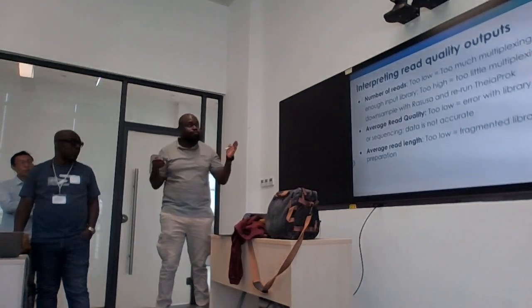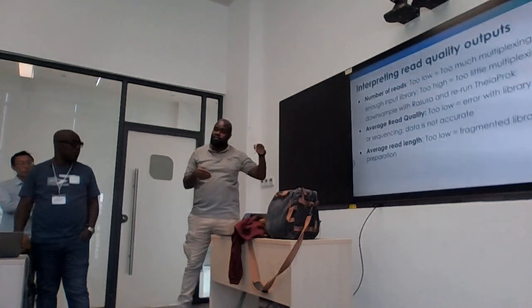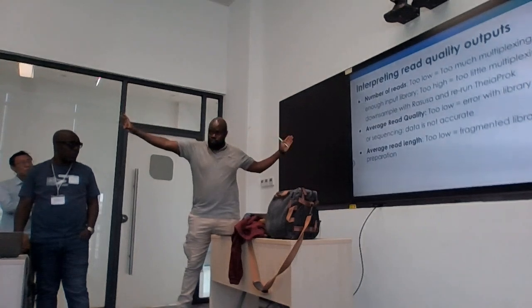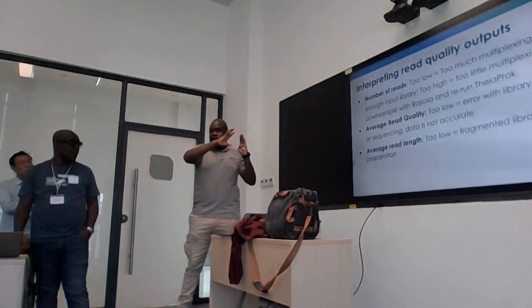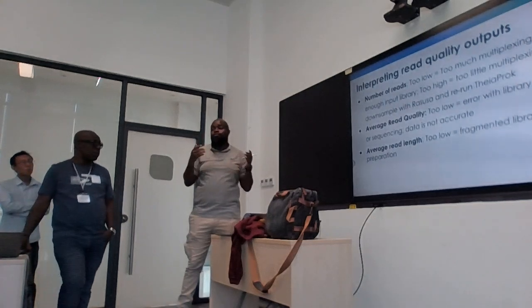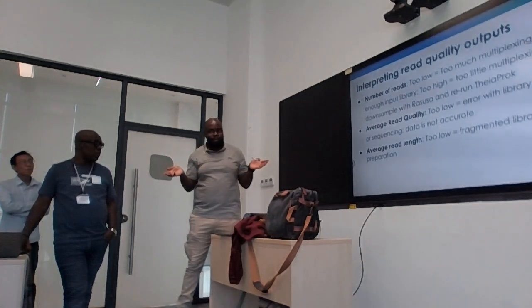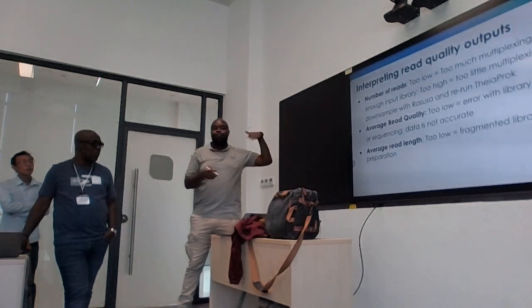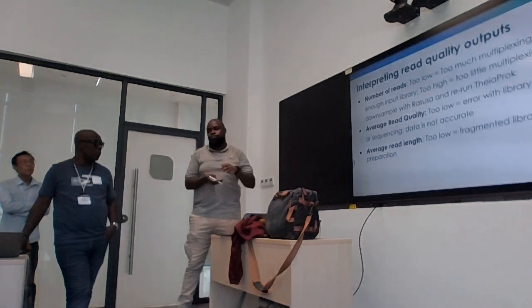So that's why we needed to normalize the reads to a lower sample, but still representing the whole genome and also a varied quality. Often, if you use a good tool, you don't expect any problems. Even though the normalization process is a bit random, it's usually the solution if you have too much and you just need to reduce it.